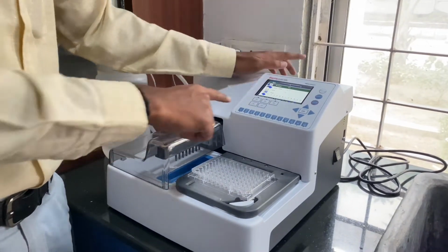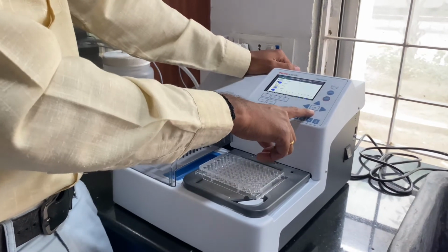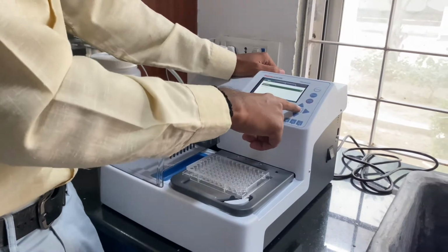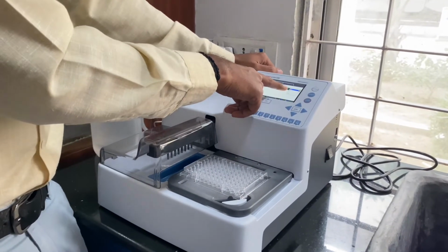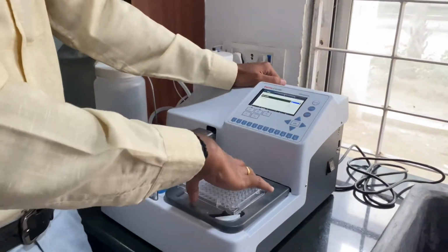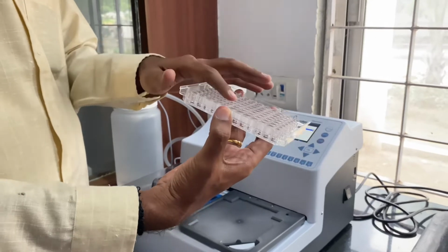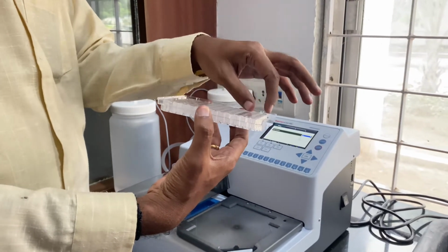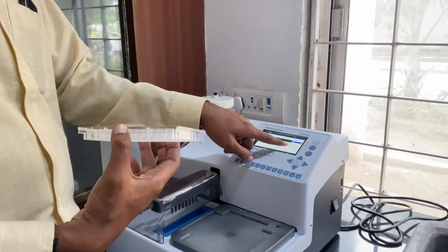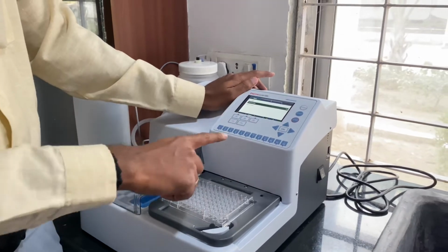So in test, which head are we having? 1x8 only, so no need to change the head. Plate, which plate are you using? Either flat bottom, U bottom, V bottom, or star bottom. This depends on which plate you want to wash. It is a flat bottom plate as of now. Like this you will have U bottom plate, V bottom, so different types of plates, and you have to select that plate. Currently it is flat bottom, so I will say flat.